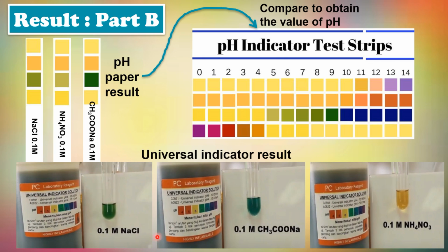There are three kinds of salt here, and you have to determine whether each salt is neutral, acidic, or basic.